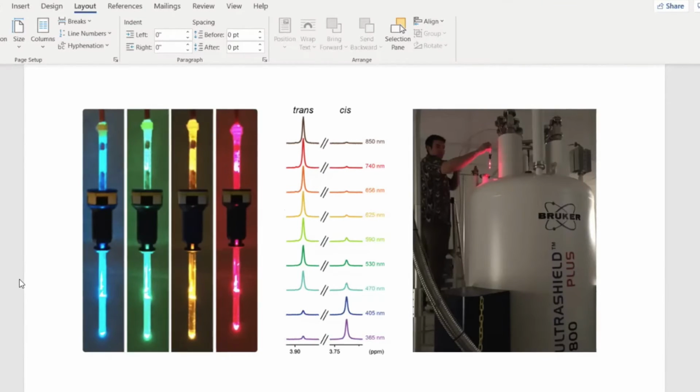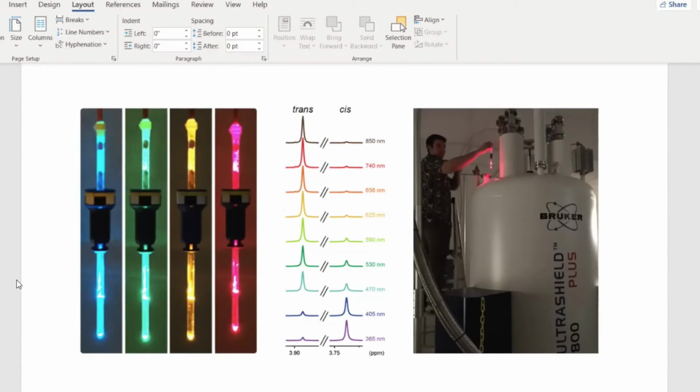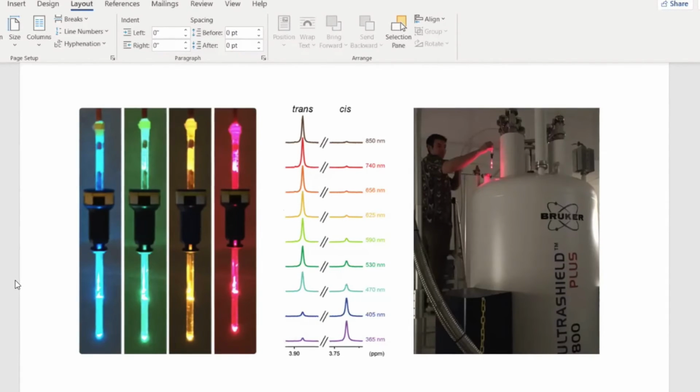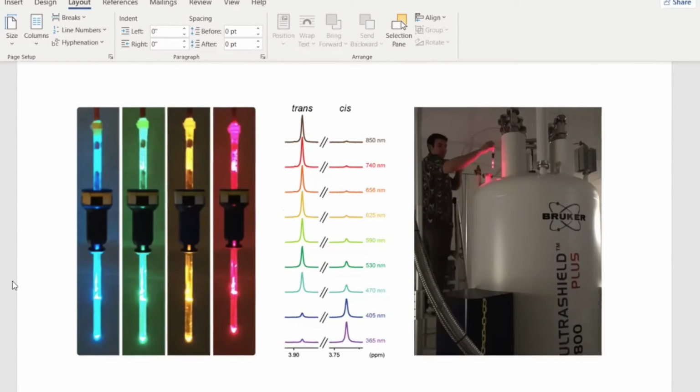You need to make sure there's no torsional strain on the NMR sample from the fiber optic. So Jeff allowed me to make a pulley going over the NMR to feed my fiber optic through, so it was only coming down vertically instead of pulling on the sample. And they also allowed me to not eject and inject with air. I can actually feed it down with the cable.